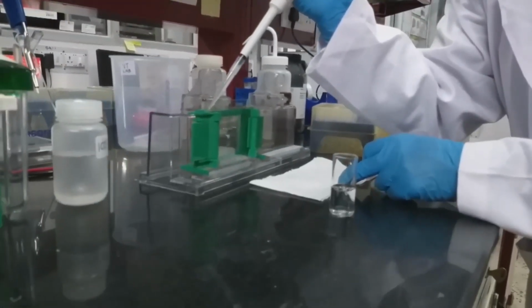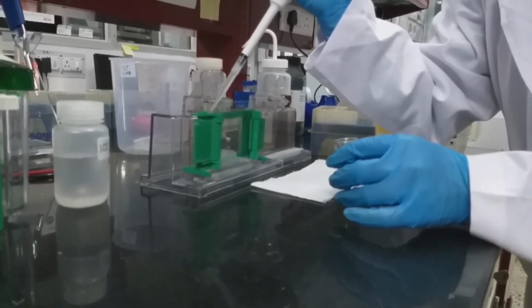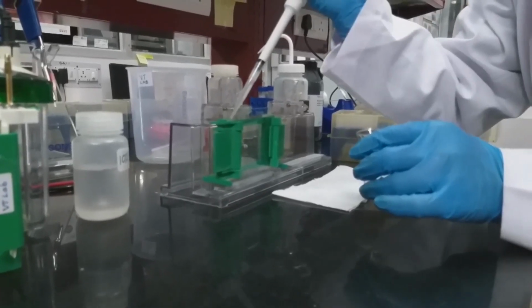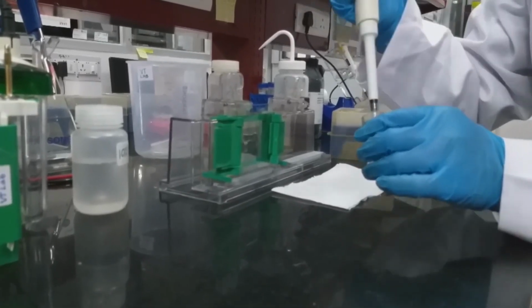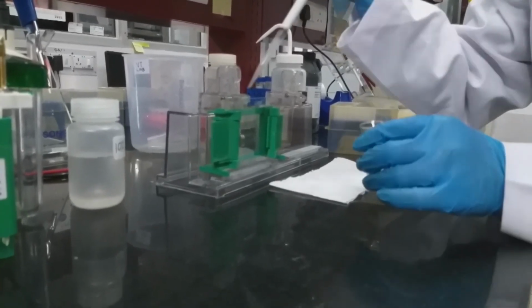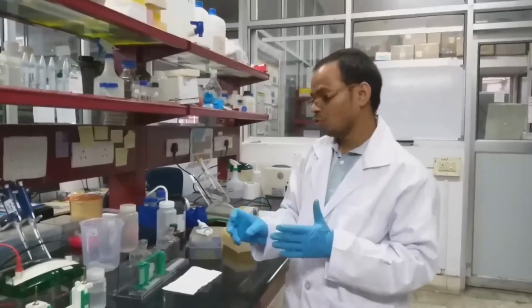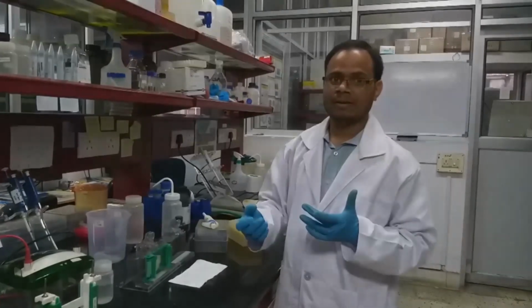So after this, on the top layer, we have to overlay with some solvent like 2-butanol or isopropanol or with water.